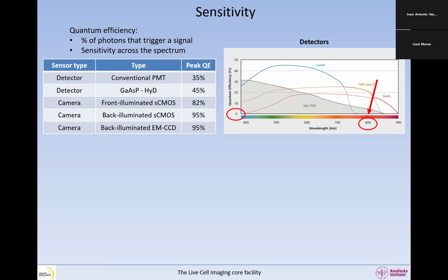So this is quite common, but in general, it is not the case that suddenly your detector stops detecting and it's much lower than expected. So you don't really do any controls for this, let's say every year or something? No, we don't do any control for that. So the lasers have a tendency to go down. It would be very, very difficult to control because you would have to have a certain environment where you can fix the excitation light as well, which is something that we do not have in a core facility in general.